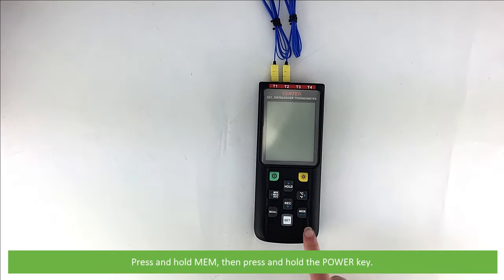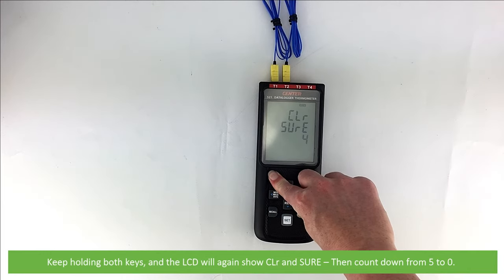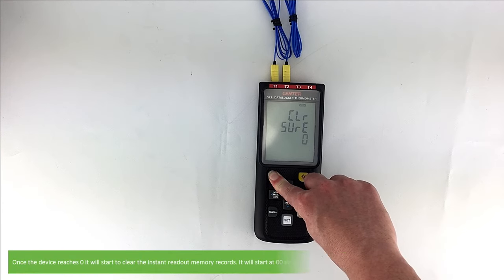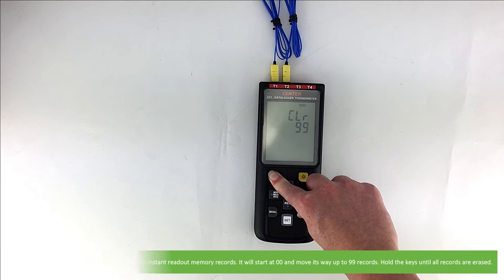Press and hold the MEM key, then press and hold the power key. Keep holding both keys and the LCD will once again show CLR and sure, then count down from 5 to 0. Once the device reaches 0, it will start to clear the instant readout memory records, starting at 0 and moving up to 99 records. Hold the keys until all the records are erased.